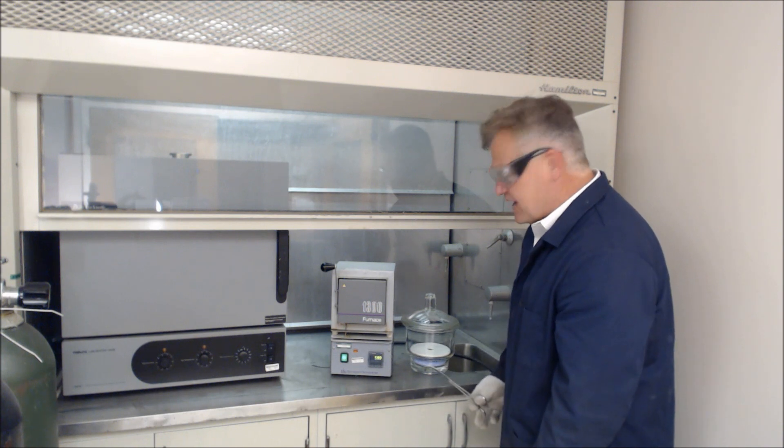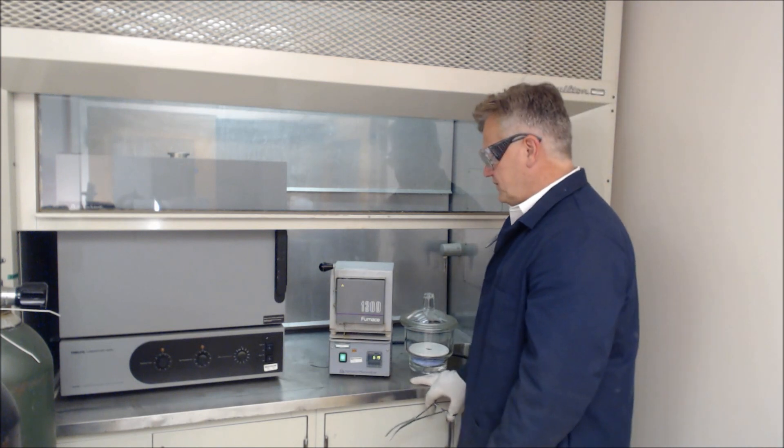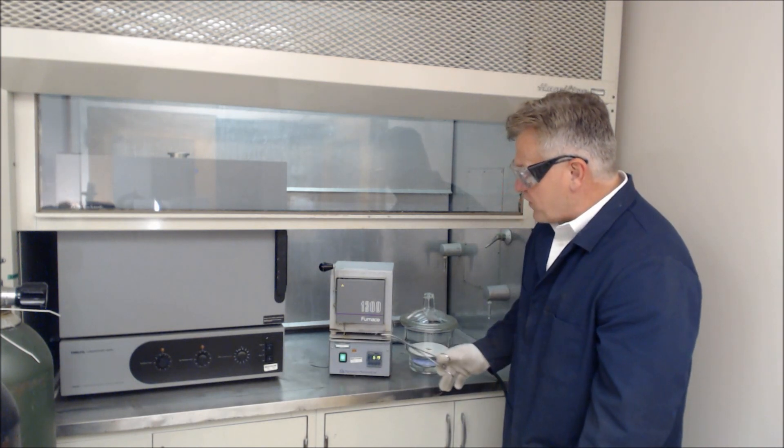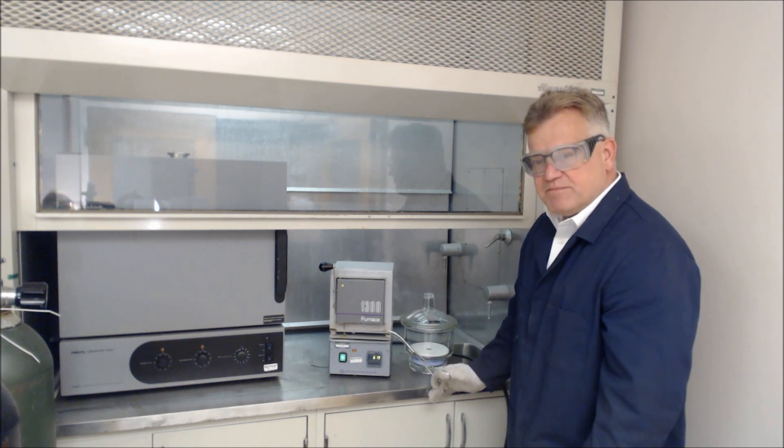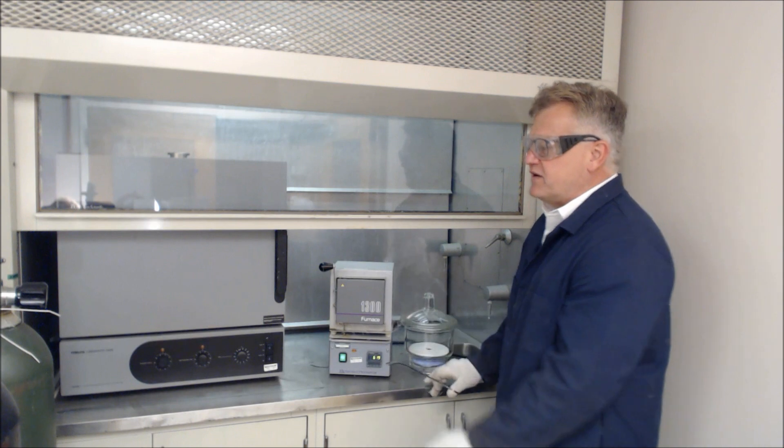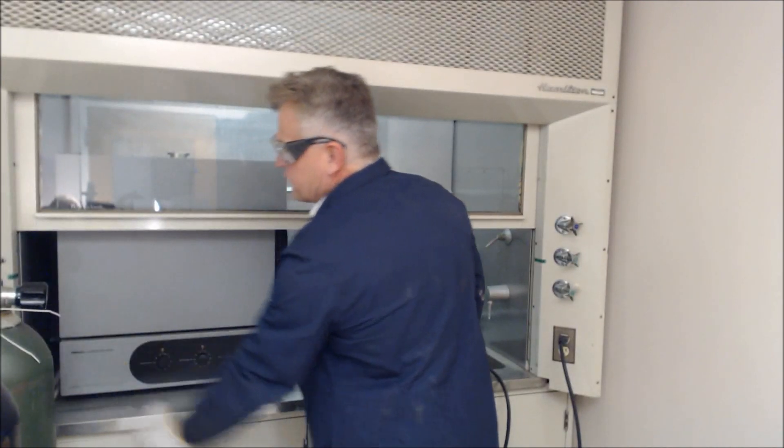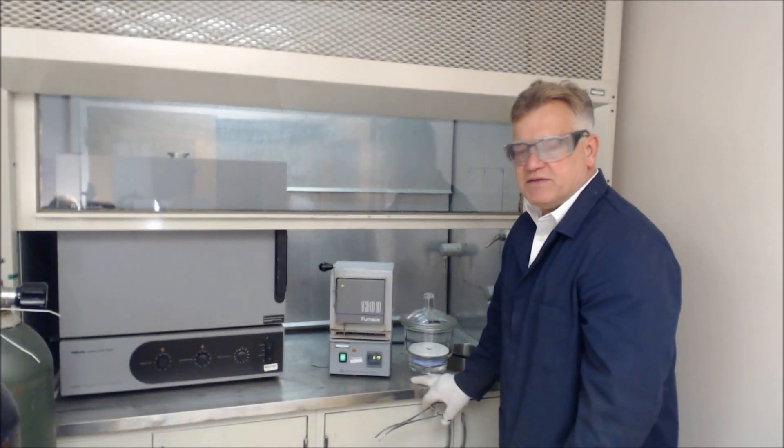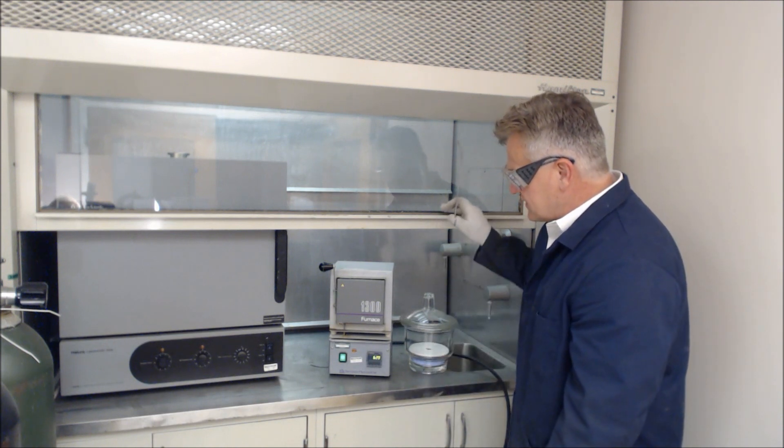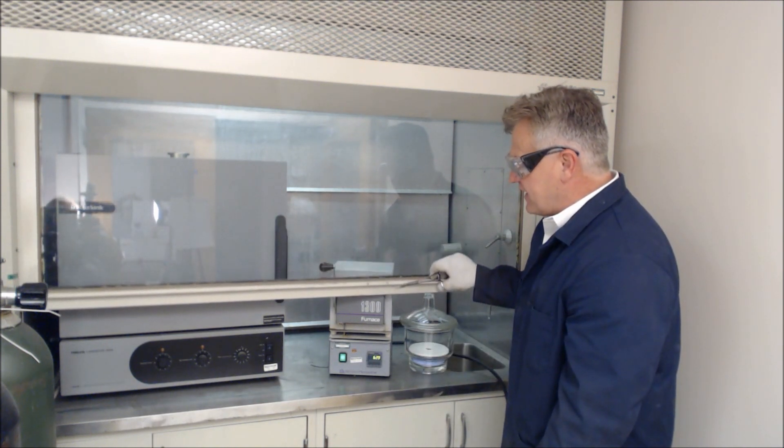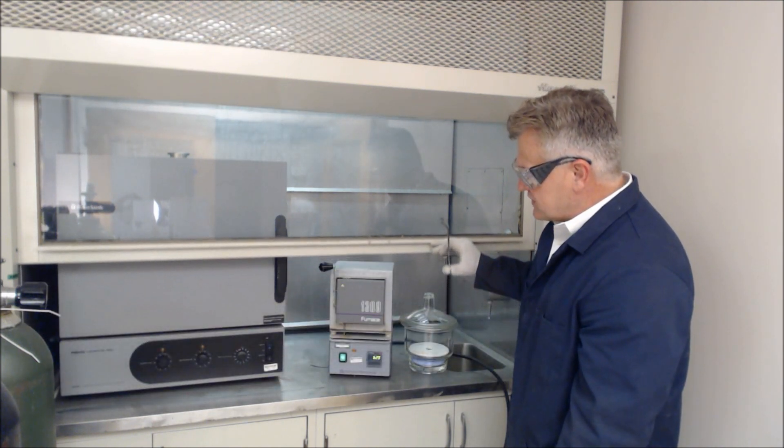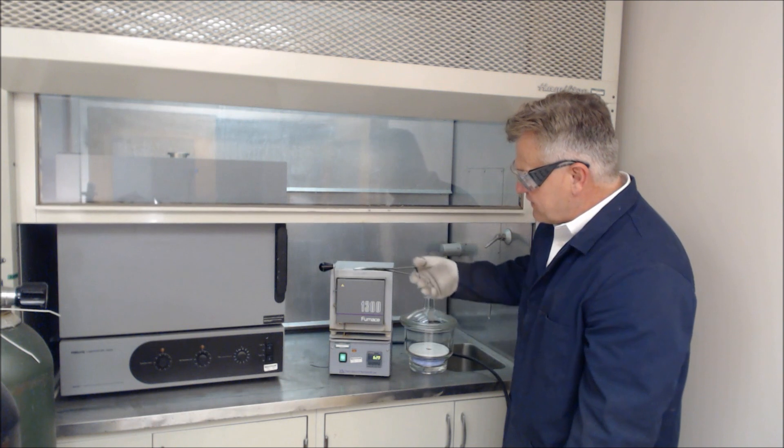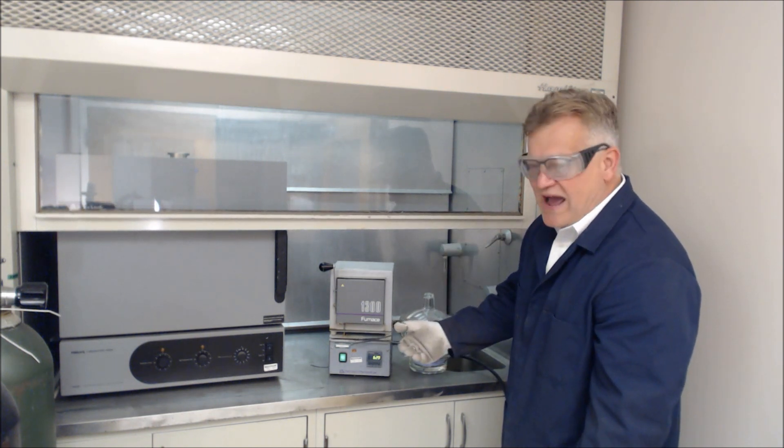The desiccator is there so that it doesn't absorb any moisture. You can see that smoke is developing here. We do have to turn on the fume hood. That's why we have this underneath the fume hood. I didn't want to turn the fan on because of the noise it would generate, but you can see that we would have to close this down and conduct this underneath the fume hood. The vent, this smoke, is producing a wax.